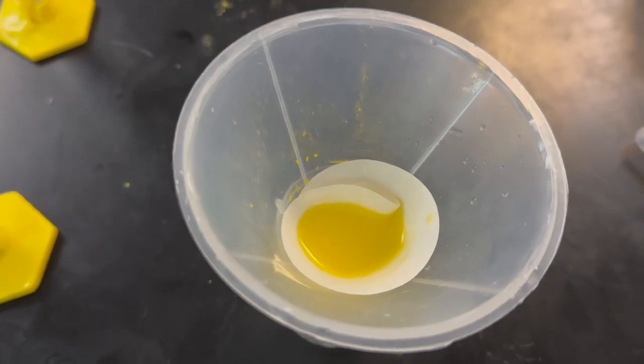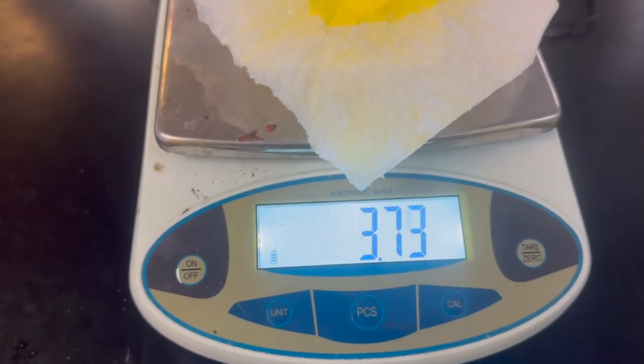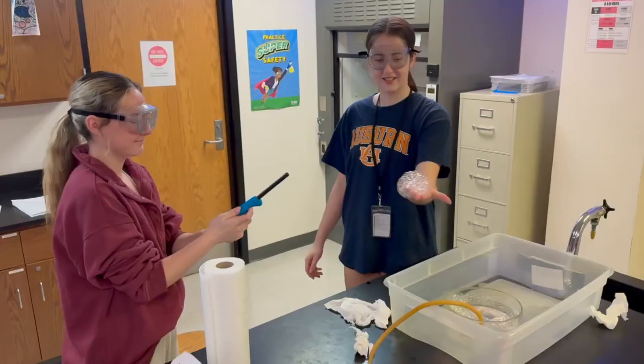So the percent yield, the mathematical yield versus what you're about to see on the screen. Now remember, for this number, you need to subtract the empty weight of the filter and the boat. But you will find that you have a very, very, very high percent yield, and that's fine.